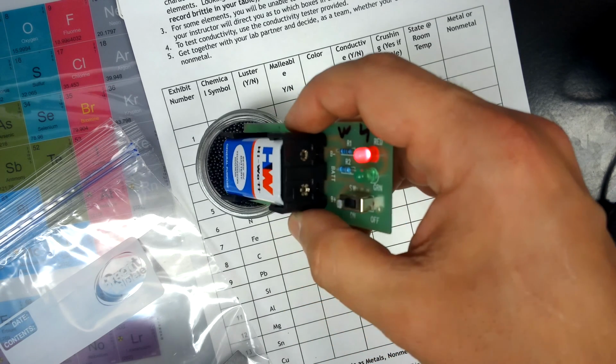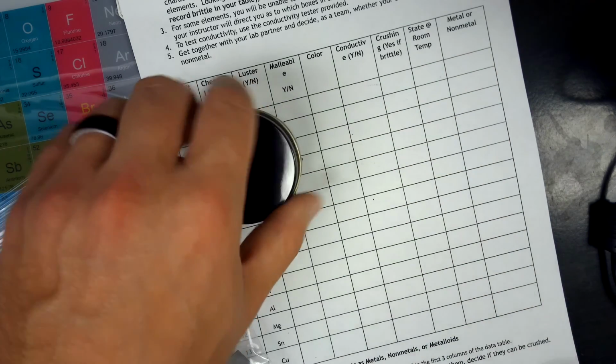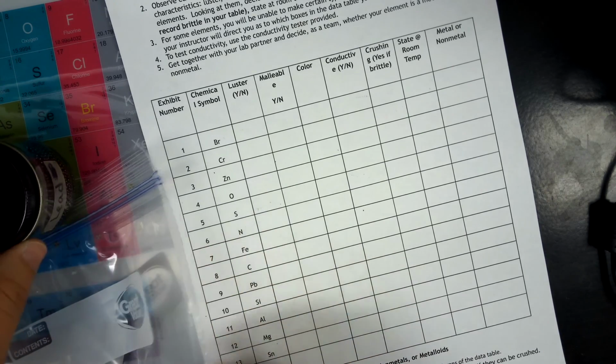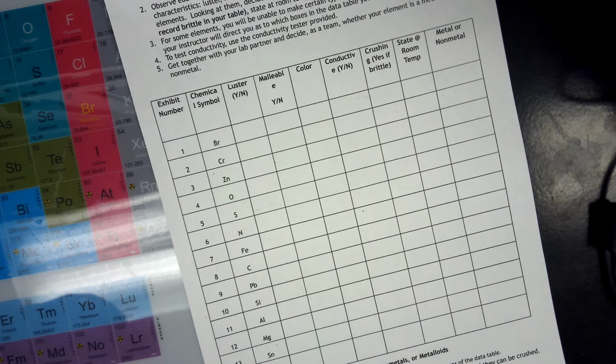And you can see that even with the little beads there, it is conductive. It is that gray color, clearly very malleable in its larger form, not crushable, stuff like that. And then these ones aren't on your list, but they're just kind of cool.